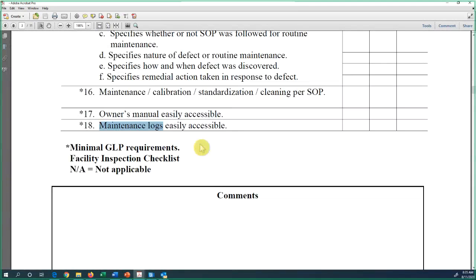logbook specific for the instrument. The log could be a couple of things. You can have 2 sessions or 2 different logbooks. One is for the use: every time you use the instrument for work, that tracks how you do the work. One is for necessary maintenance, when something's going wrong. If you mix them together, it's very difficult to find out what's really going on.